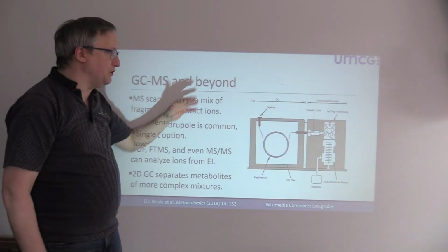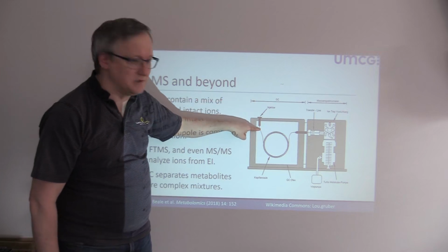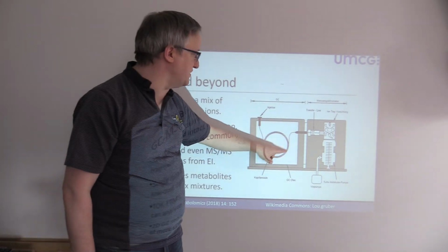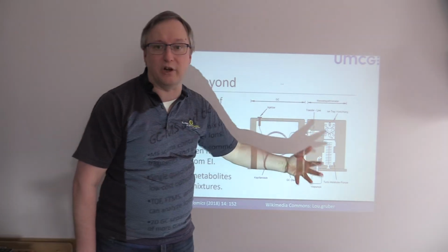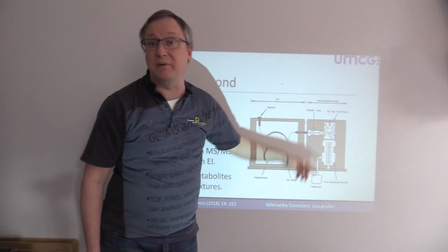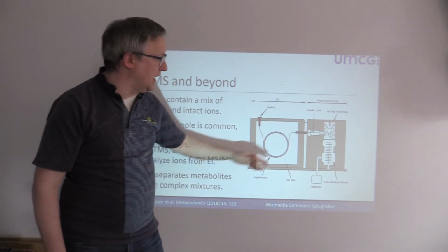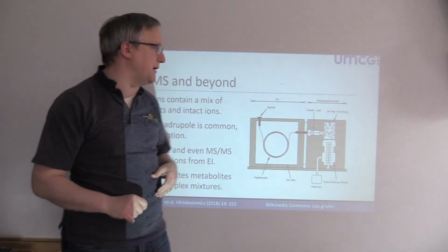All right, so all told, we have some process by which we are injecting our samples into these long columns, these meter long columns. We have a transfer line that's also doing this electron impact, that's creating fragments from whatever's passing. Then we have maybe an ion trap or just a quadrupole, either way, that's measuring what ions are being produced at this moment in time.